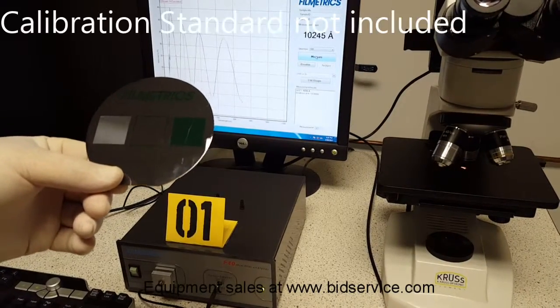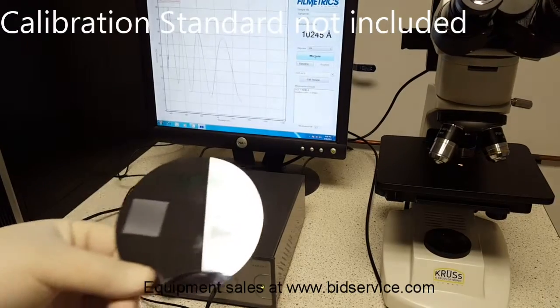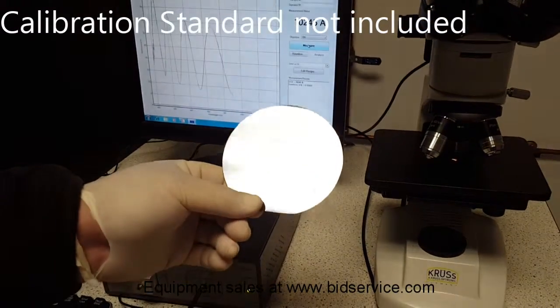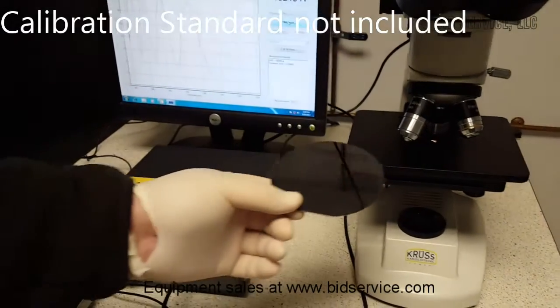Here's a functionality test of the Filmmetrix F40. This right here is a calibration wafer, and there are three dots in it. One is the focus.